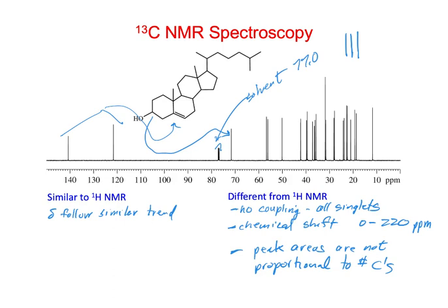Oh, so you still use deuterated solvents? Yes. We still need deuterium. In the NMR, the signal for the NMR locks as a reference signal onto the deuterium. And that's how it compares one frequency to another frequency.